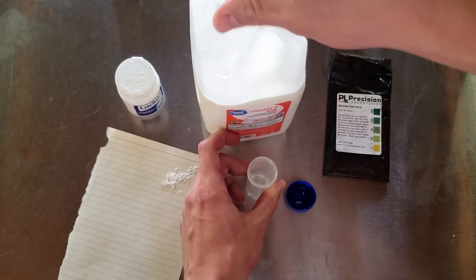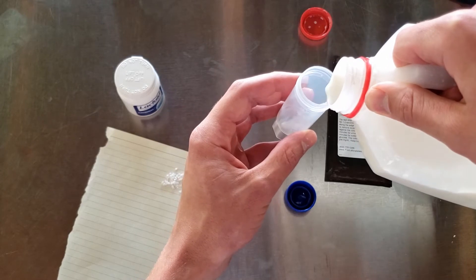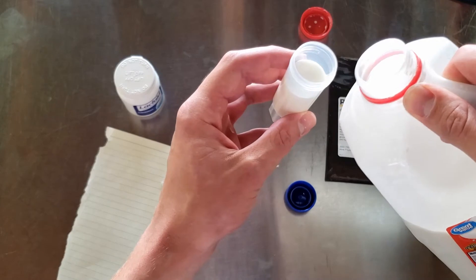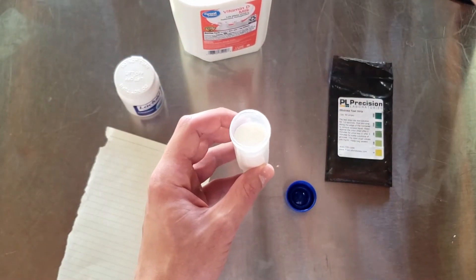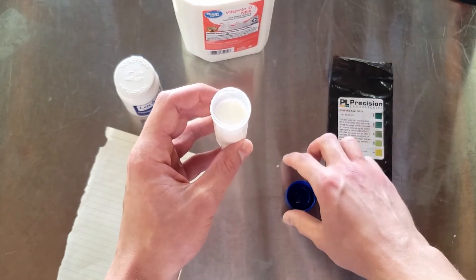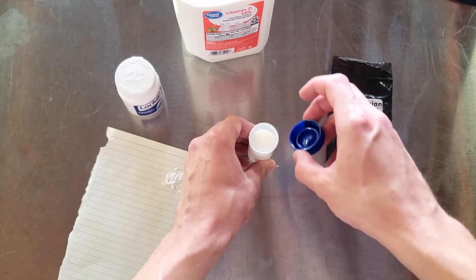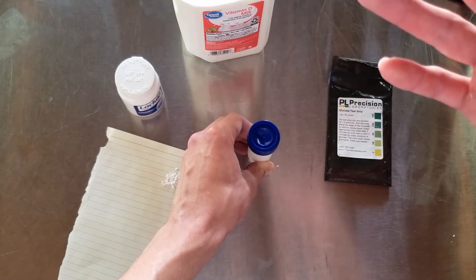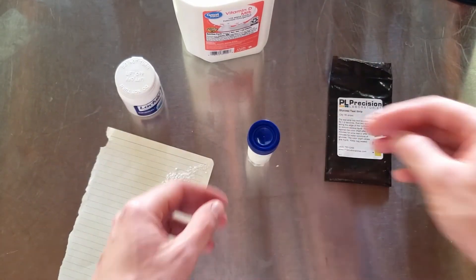We're going to add a little bit of our sample to our container. If you're testing something like a yogurt, you might need to dilute it with water so the reaction happens in a liquid, since the enzyme can move around a bit easier. If you do that, make sure you understand how much you're diluting your product. So if you add 10 milliliters of yogurt plus 10 milliliters of water, then you need to multiply your final calculated lactose concentration by 2 to get the actual product concentration.